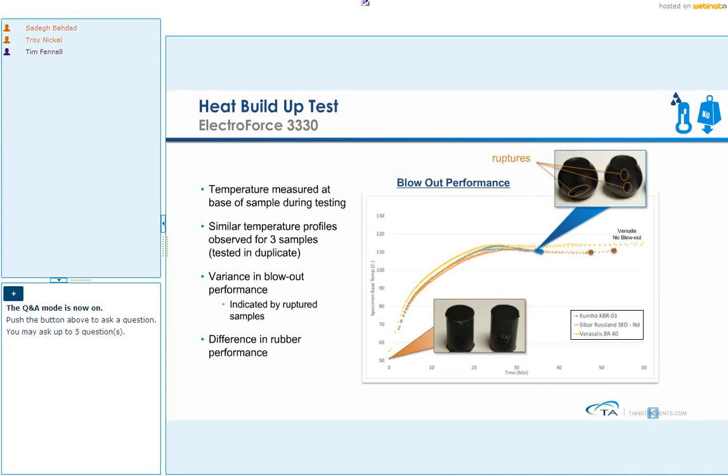Those gases are trying to get out, and in tandem with the stress that you're applying, that breaks the external wall of the cylinder, and that's why it's called a blowout test. So here we are looking at where we started and how the samples that failed look.